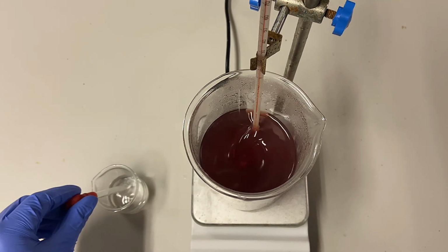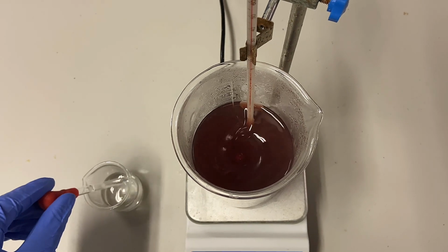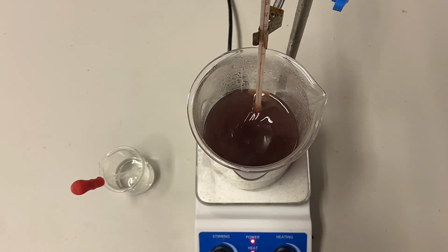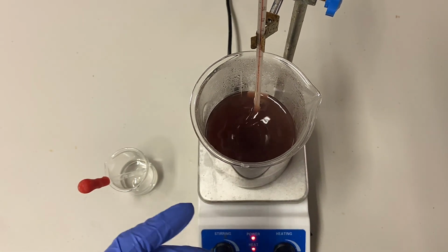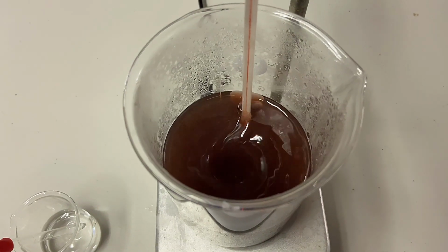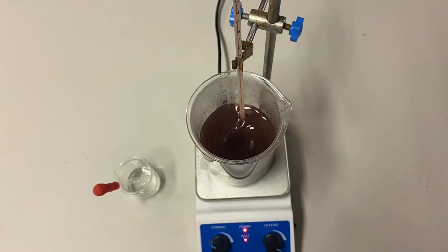But after a little while, you should see this solution turn from a kind of clearish red to a darker brown color. It's already sort of starting to do it. It's hard to see on camera. And I'm just going to let it sit, probably continue to dump some of that in. And then after a good couple of hours, hopefully it should have oxidized all of the manganese. I'll be able to get it in one filter pass, and then that should be done. But as you can see on the camera, it is all starting to turn a bit brown. It is a little bit difficult. The iPhone camera doesn't have the best ability to grab really small color changes, but you can see some difference there. So I'm going to keep putting this in and check back in a second.